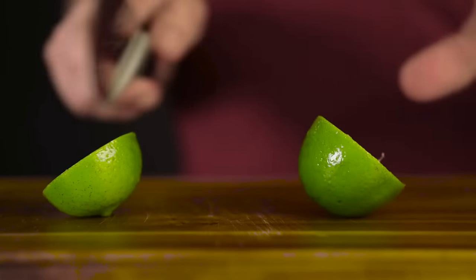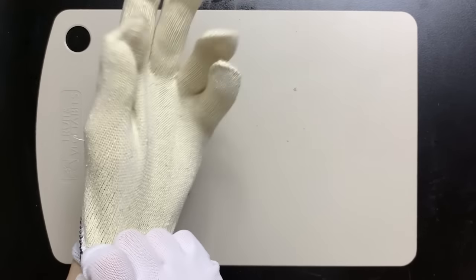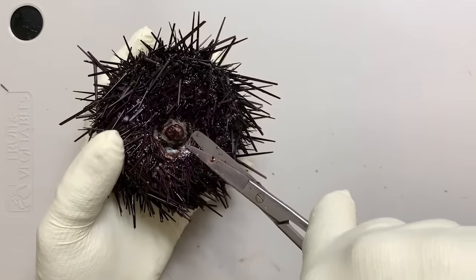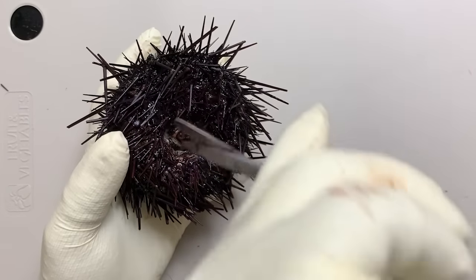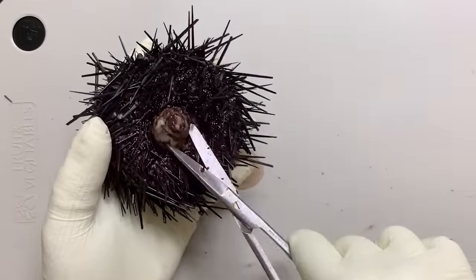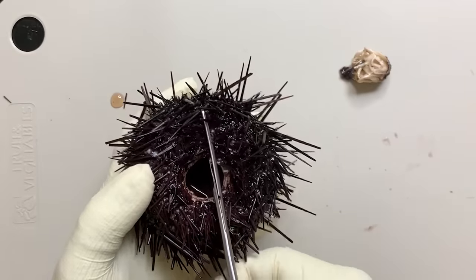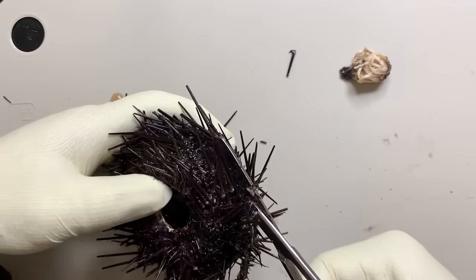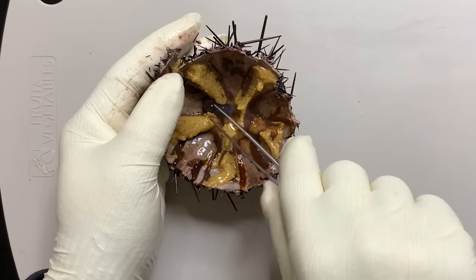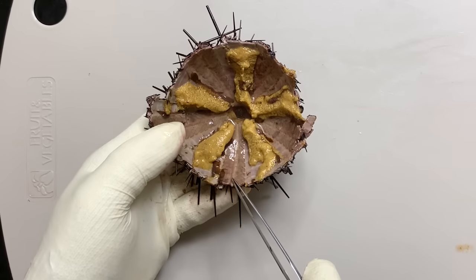Now let's dissect the sea urchin. The spines of sea urchins are hard and sharp, so be careful. First, cut and remove the soft tissue around the mouth. If you cut the side a little bit and cut it in half, you can see the inside like this. If you remove the sea urchin's intestines and food, this form will appear.